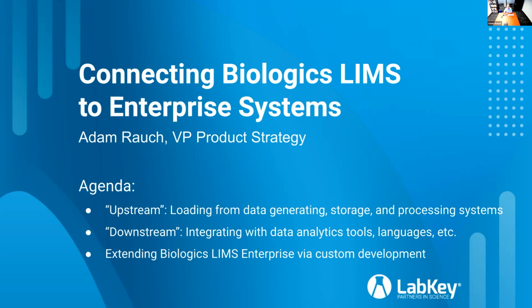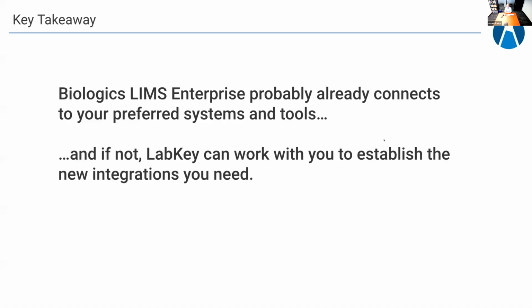What I've tried to do is illustrate through some concrete examples. I've tried to make it as real world as possible, showing actual scenarios and use cases from Biologics LIMS clients and how they have integrated their biologics with their infrastructure, with their enterprise systems. So this is the key takeaway that I'm trying to convey. Hopefully I succeed.